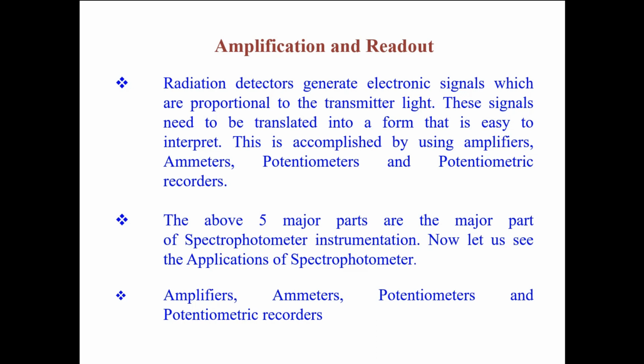Okay. Whereas in the case of readout devices, usually the readout devices are the electric devices which can show the amount of electricity generated in a particular time. So likewise, you can calculate the amount of electricity generated as and when there is an application of the sample. So that's what we can see.